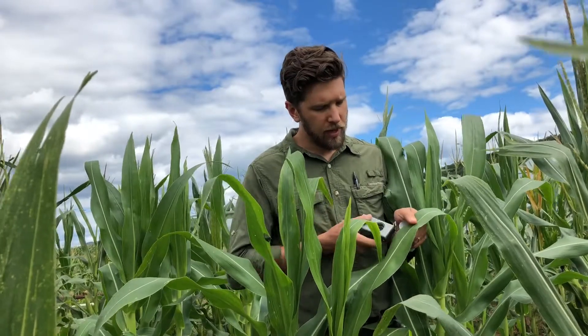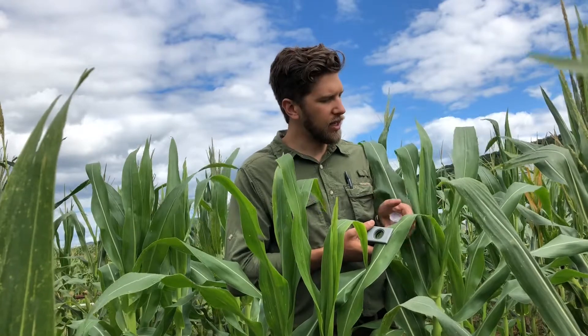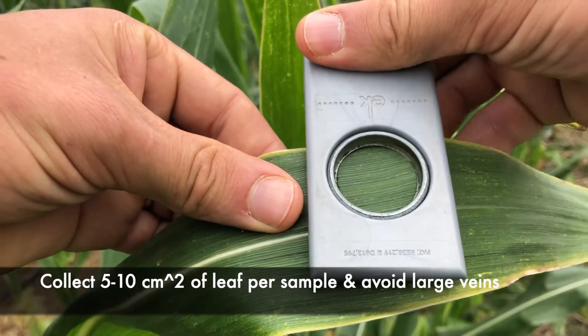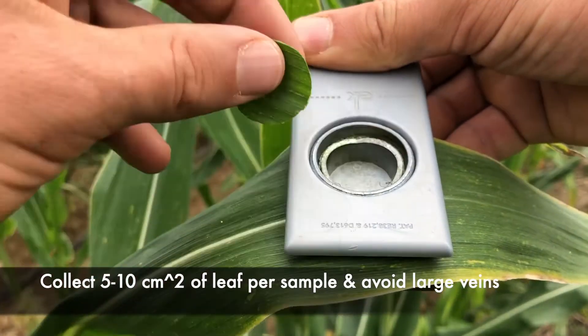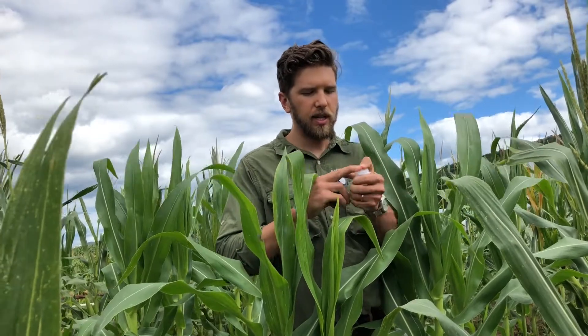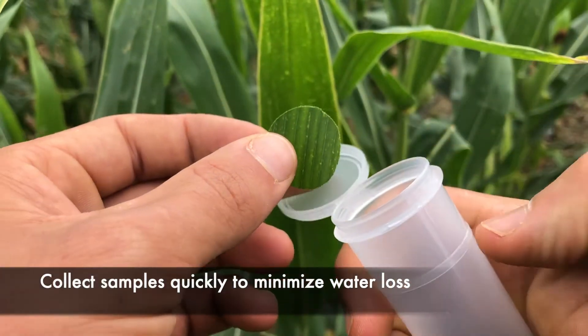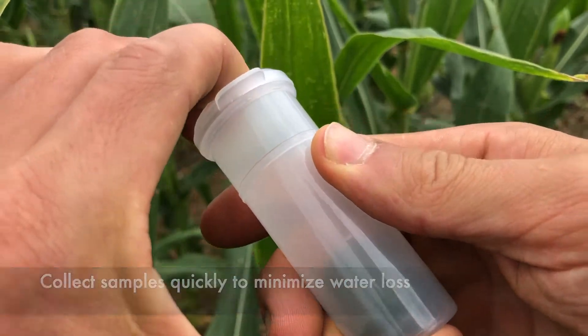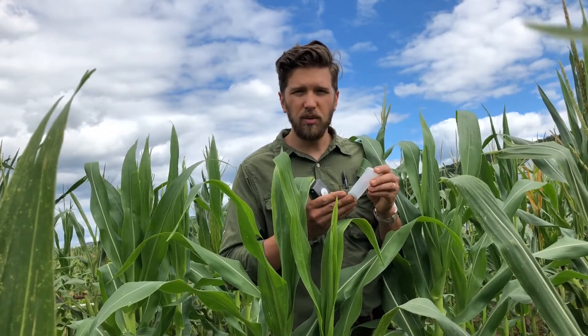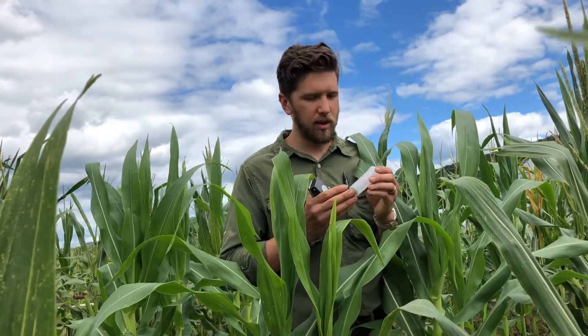For this metric, we would take leaf punches throughout the newest fully expanded leaf in the canopy of a given variety, like so. Taking several of these punches and storing them in airtight containers, we will take these back to the lab and get the fresh weight of these disks, then suspend these disks in deionized water so they can absorb additional water that they may have expelled through transpiration.